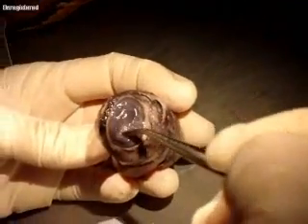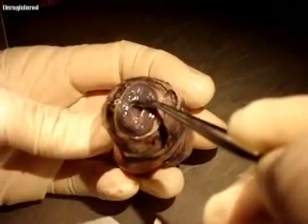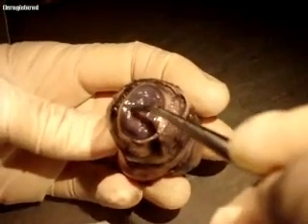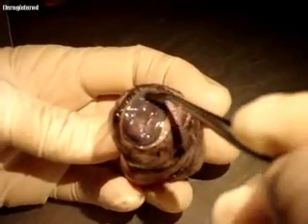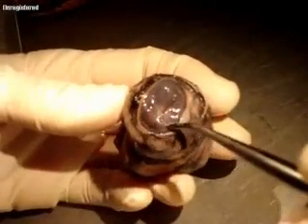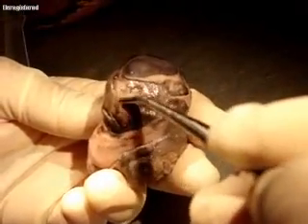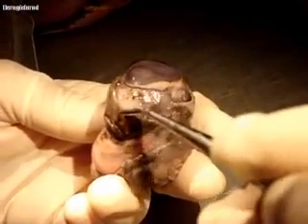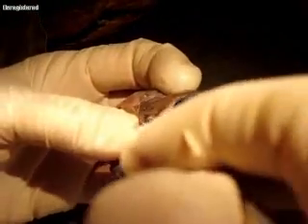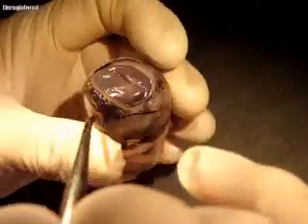So, if I touch this outer surface of the eye, what am I actually touching? Conjunctiva. This is conjunctiva. So right below the conjunctiva, the next layer would be the cornea. And the cornea is the clear anterior portion of this very hard outer shell called the sclera. So this is all sclera here. There's some muscles up here as well. There's a bunch of muscles on this side. It's all a bunch of muscles.